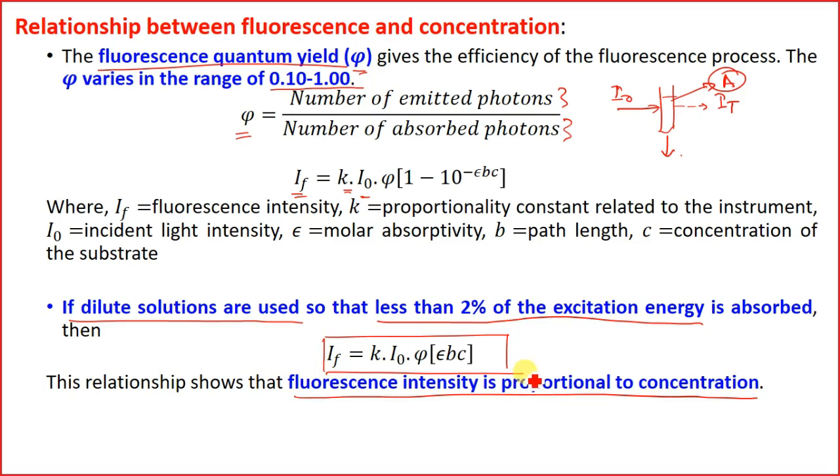This is for when there is a high absorption coefficient. So you have to see that the solutions are dilute enough so that less than 2% of the incident radiation is absorbed.